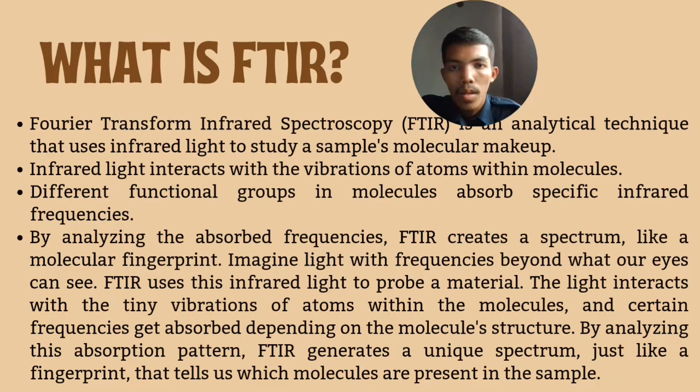Now I will present the introduction. So what is FTIR? Fourier transform infrared spectroscopy is an analytical technique that uses infrared light to study a sample's molecular makeup. Infrared light interacts with the vibrations of atoms within molecules. Different functional groups in molecules absorb specific infrared frequencies. By analyzing the absorbed frequencies, FTIR creates a spectrum like a molecular fingerprint.